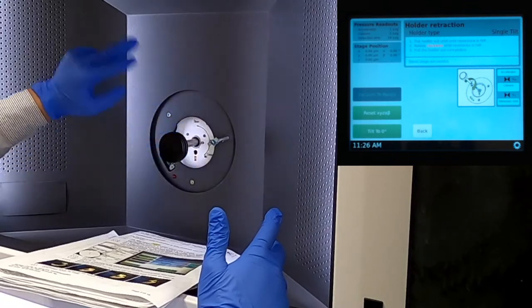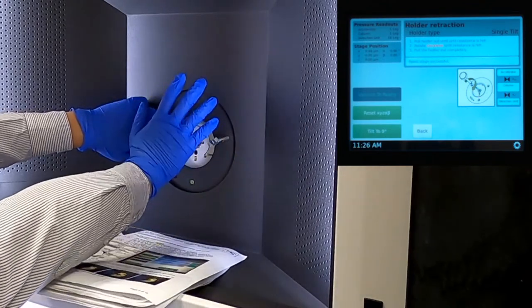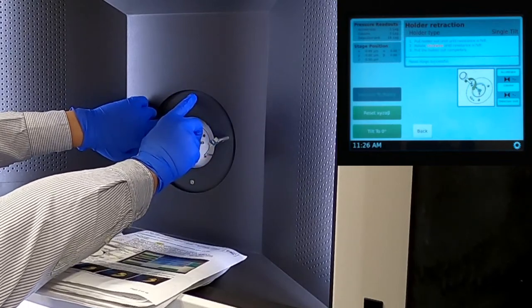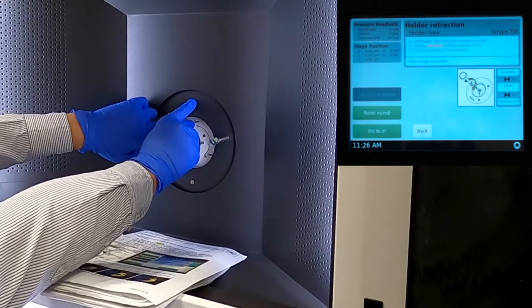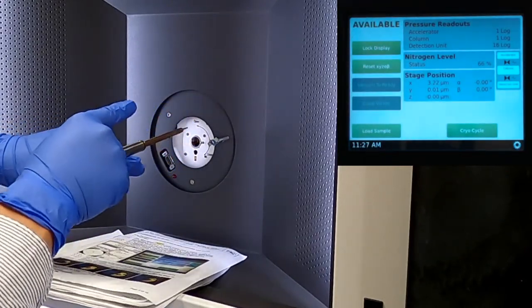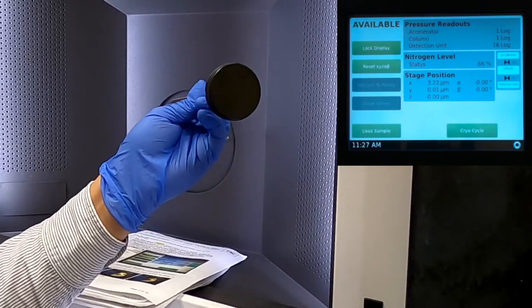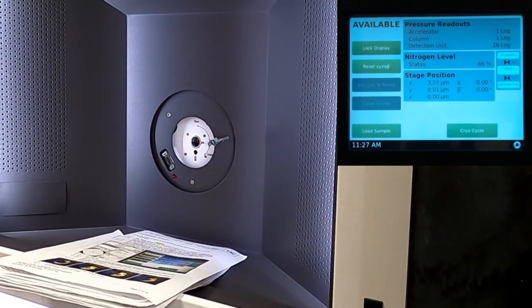So one last step is you still put your left hand here, and use your right hand, use your palm to grab the holder, the black piece, and just use your index finger to press the plate and take it out gently. Right, so that is the TEM holder. This one is the single tilt, and we do have a double tilt and a cryo and a tomography holder available on the Talos. If you need to use those holders, we can set up a training separately.